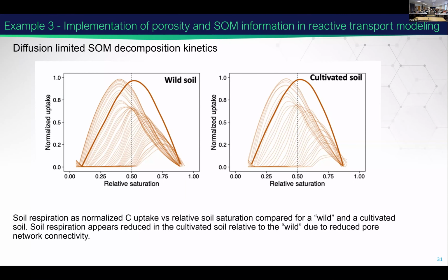Okay. I don't know beyond that, but I think that's the take home. Yeah, I know we have data for more soils now, and that might be more clear, but I don't have that slide here. I just wanted to highlight the applicability of that sort of data for looking at biogeochemical processes.